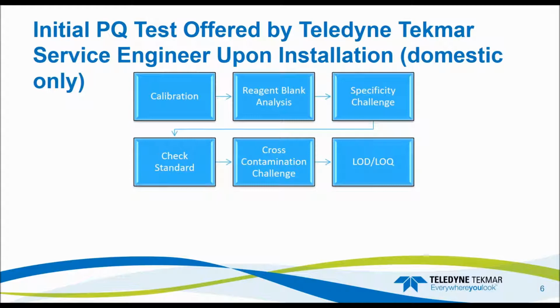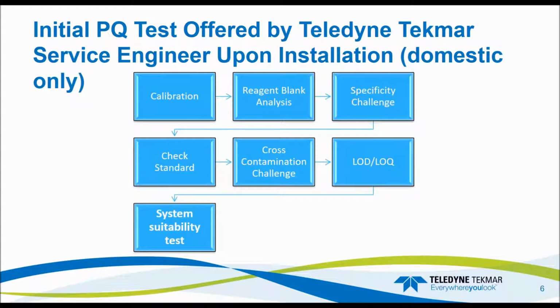If you want to learn more about detection limits, I have a separate webinar about that would fully explain it and how to calculate it. That is on YouTube, so be sure to check that out. And then they do a system suitability test, which is USP 643, that we'll be talking about today, which is running those sucrose and 1,4-benzoquinone standards.